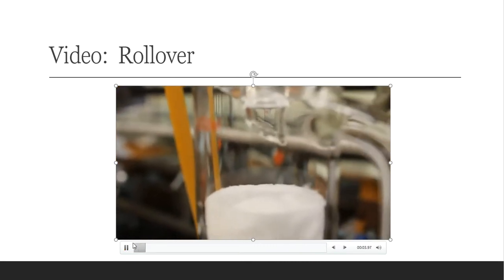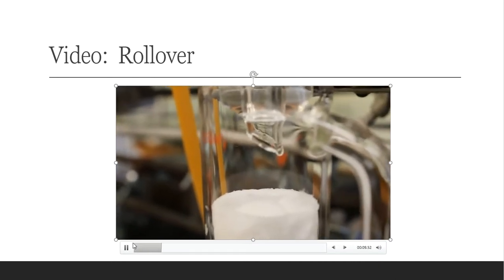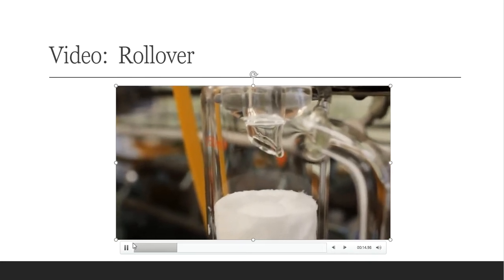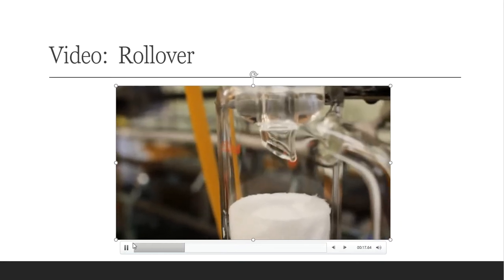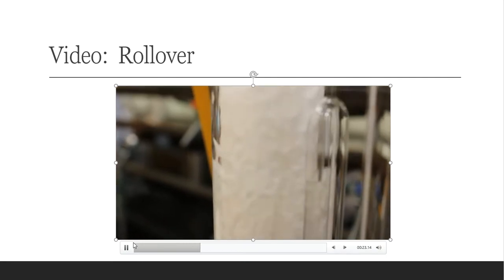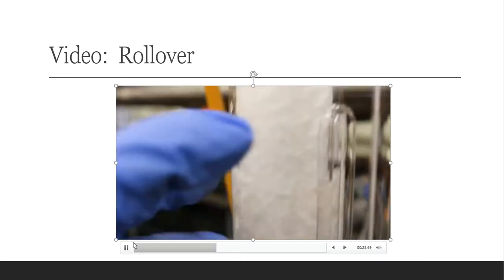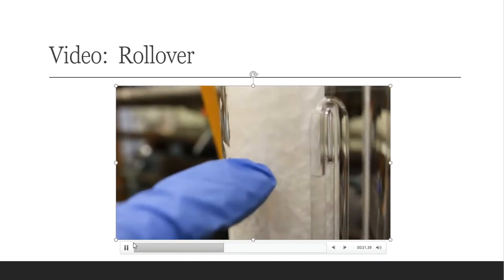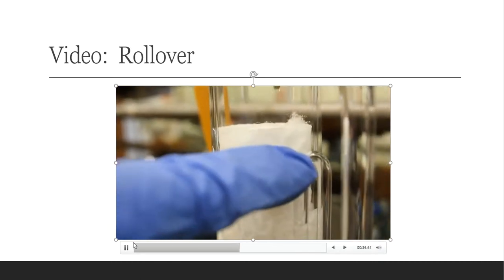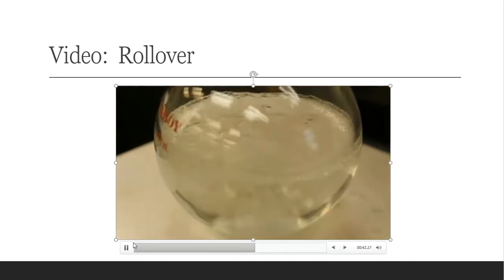All right, guys, about 40 minutes into this Soxhlet extraction, I'm starting to see drips from my Soxhlet extractor. This is a very good sign that my ether is now reaching the upper chambers of the Soxhlet. All of that ether is slowly dripping into the thimble that sits down below, which is slowly starting to fill up with liquid at the very bottom. Once this liquid, right now this is the level, gets up to this neck, this curvature piece, this thing will fill up and automatically drain back down into the Florence flask that sits below.